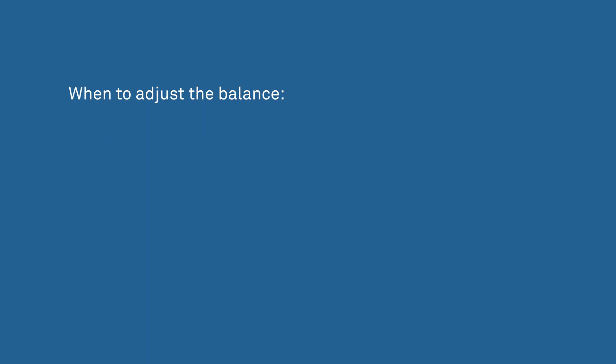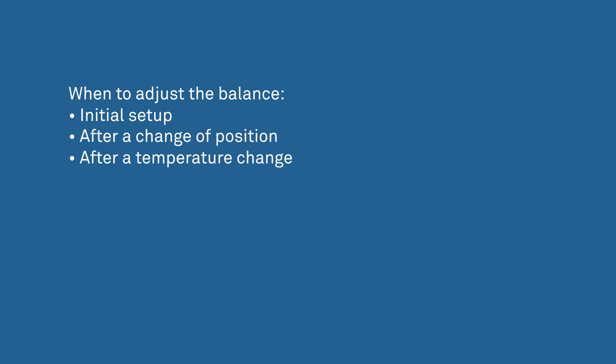For precise measurements, the balance needs to be adjusted to laboratory conditions during initial setup and after a change of position or a large temperature change. We also recommend adjusting the balance every four weeks during operation.